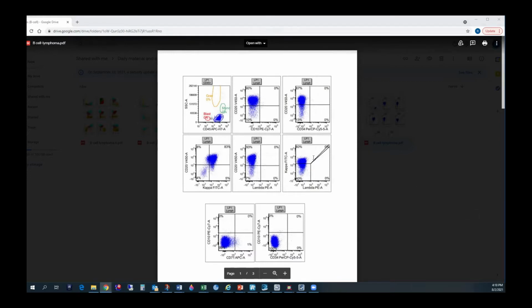Wouldn't it be polyclonal? So it would be like there is no good separation. It's just kind of sticking. So that would mean they have to wash it more, and they do something called long incubation for that. And if it is here not showing positivity for either kappa or lambda, that could be because the epitope that is being expressed is not in your cocktail. So then they add something called polyvalent that will have more epitopes or targets. So then that can sometimes help and it will show a kappa or lambda. You understand what I'm saying?